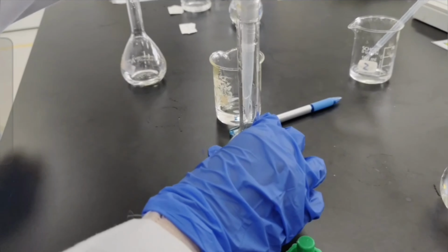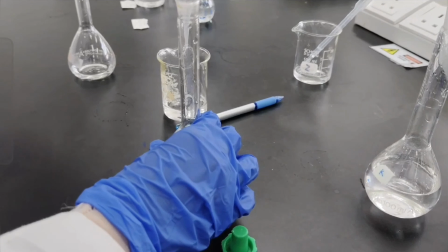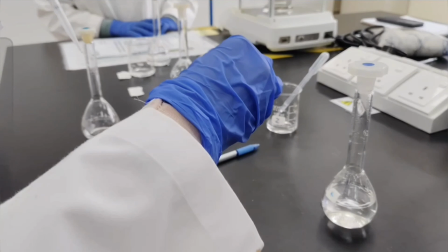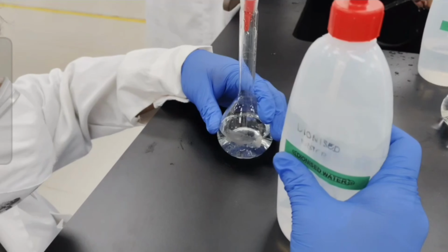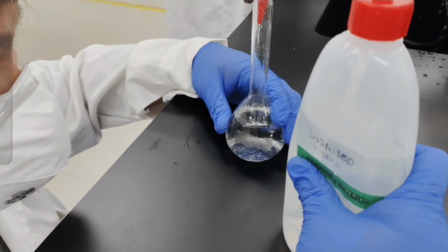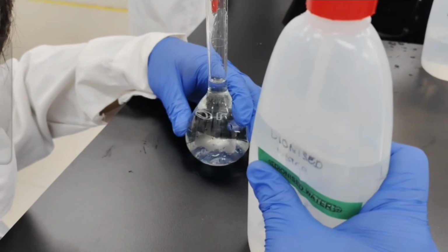First, we transfer a known volume of Na stock solution to a volumetric flask using a clean pipette, the volumetric flask already filled with deionized water beforehand. Then we fill the volumetric flask, which already contains the Na stock solution and the deionized water, again with deionized water until the mark is reached on the volumetric flask.